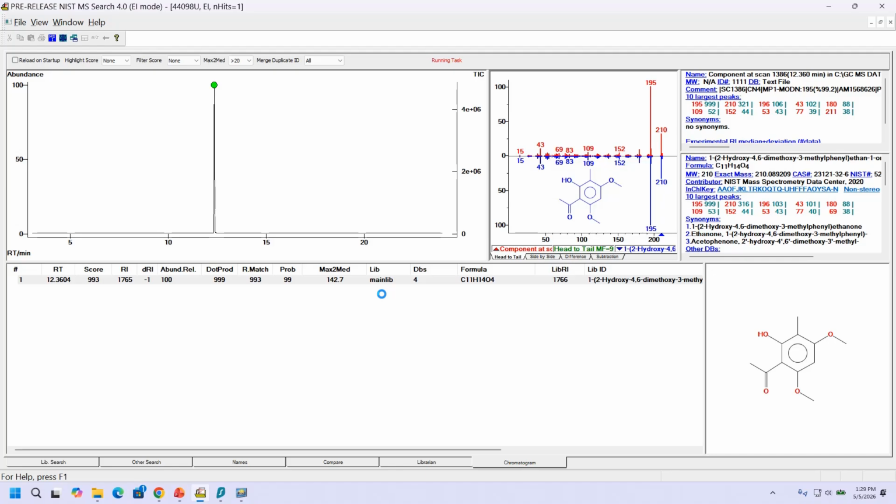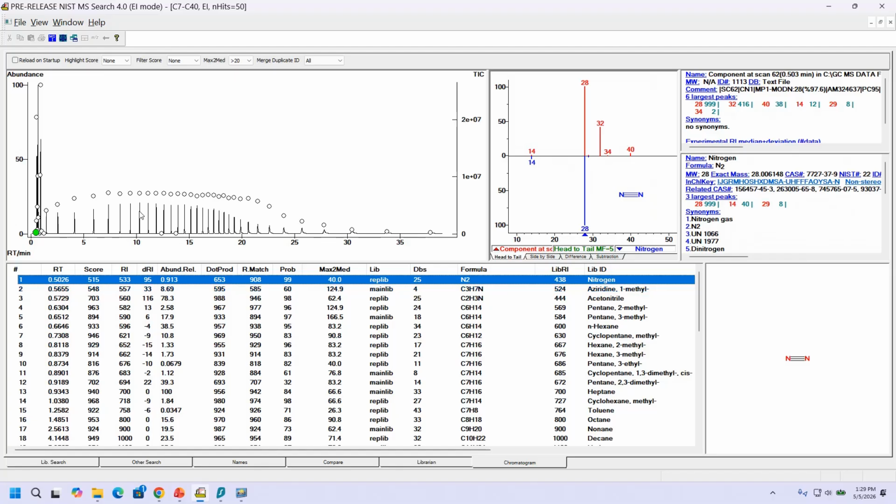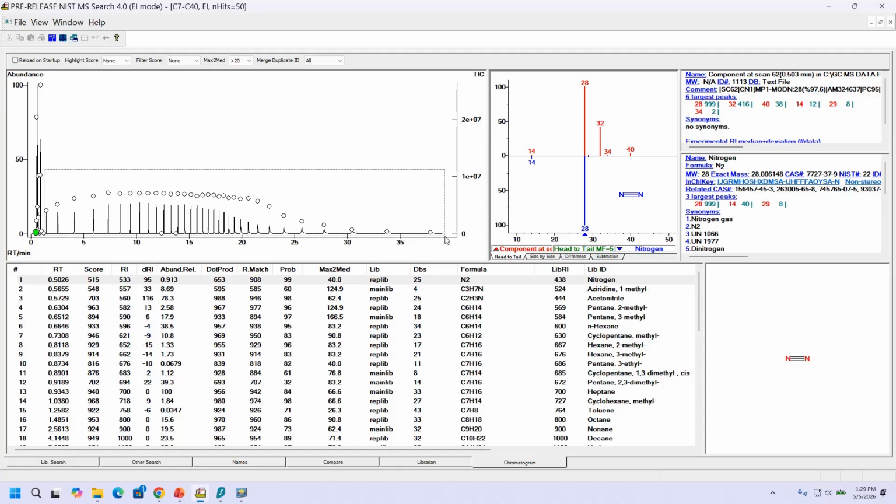And it's going to go through and compare our original file to its calibration to make sure that everything looks reasonable. And we know we're missing the C39 and 40, so that's our goal, is really to find the retention time for that. So I'm going to left click and drag here. This is the C8. The C7 is actually buried under some of the solvent at the front, so we didn't bother trying to calibrate there.